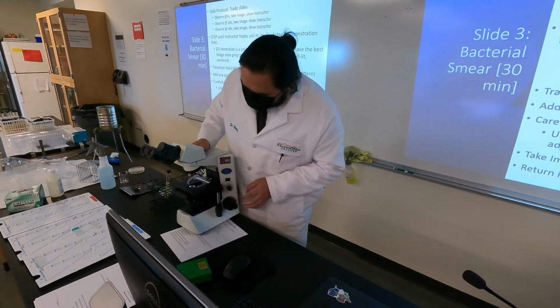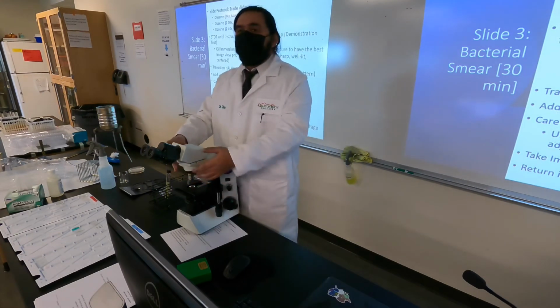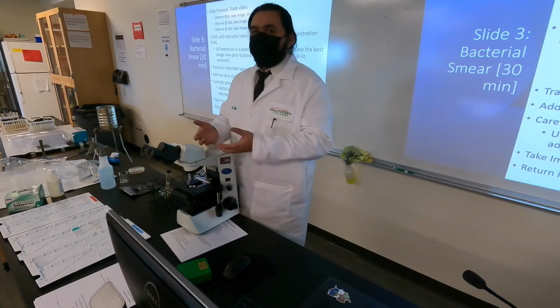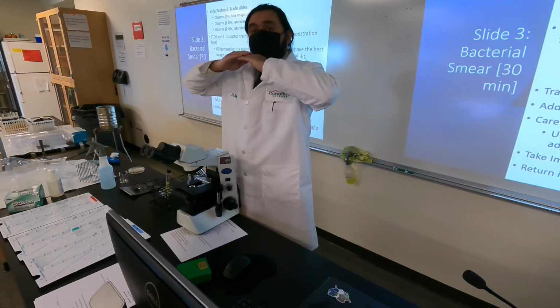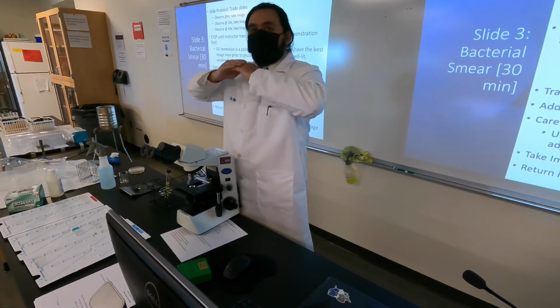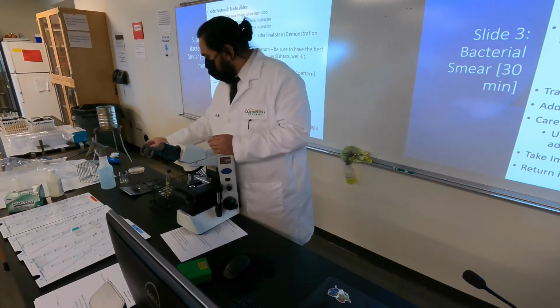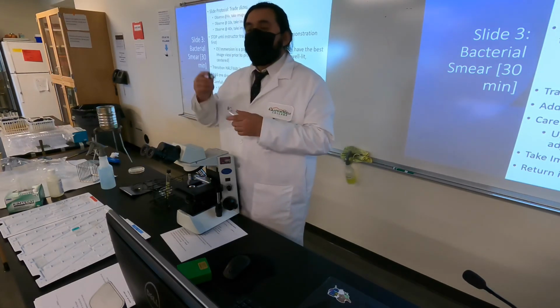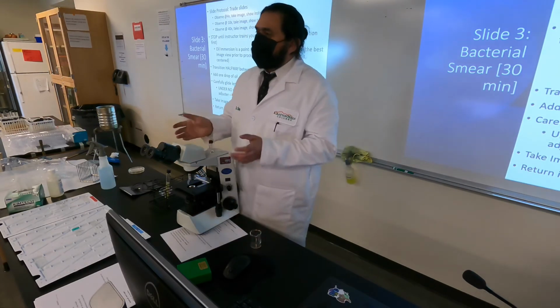So, you already made it to blue. I'm gonna keep my stage down so I make sure that I don't break anything. But you already saw that when you're at the blue objective, the 40x, 400 total magnification, it's really close to the slide. If you move any further, you will break the slide and you'll scratch the next objective. So the trick is lubrication. We use oil, right? And so how we do this is actually kind of fun.